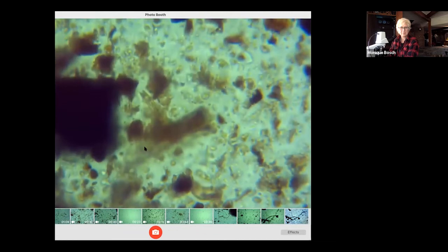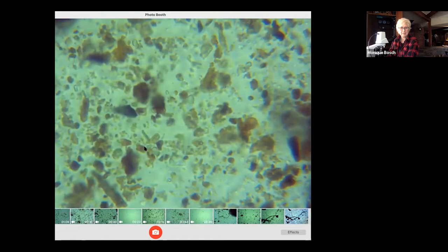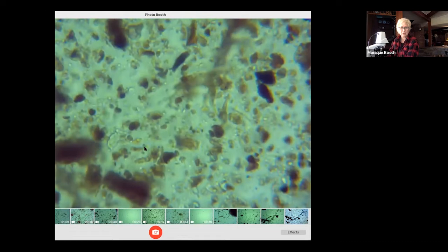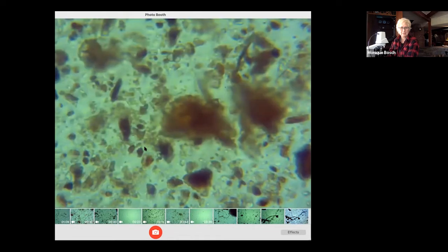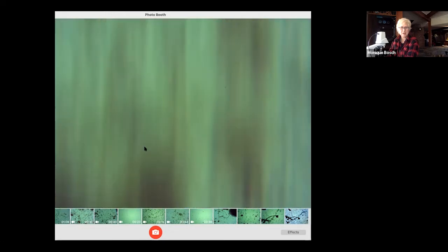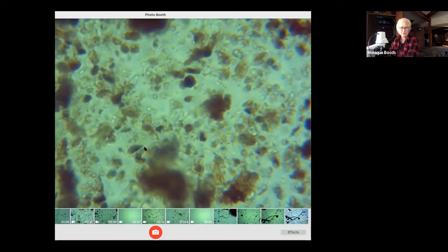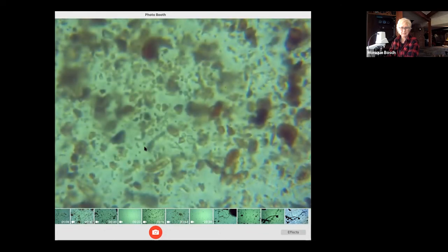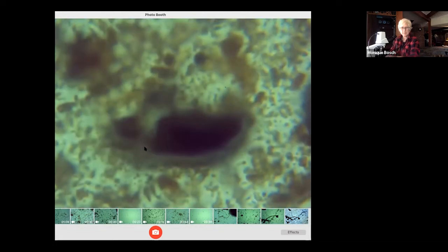So really great aggregate. So you can imagine the nutrient retention and water retention by having all of this life around the roots of your plants. Compared to that earlier image that we saw of the chemical soil, which was basically barren. The structure here and the density of it is really intense. So that's how you prepare a soil slide.